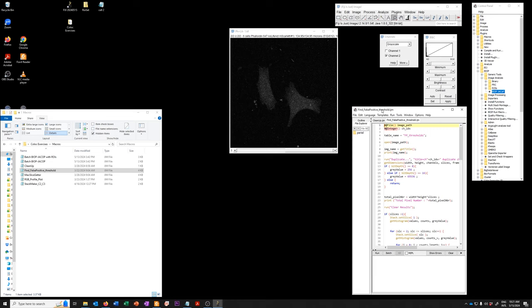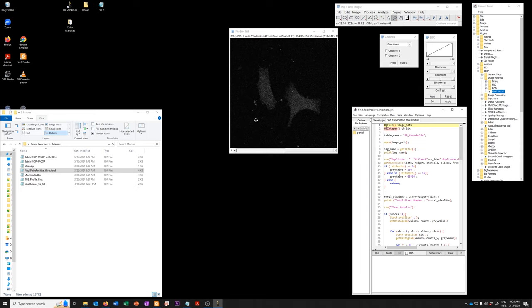So what this macro does is it looks at the histogram of a negative control image and it tells you if you accept a certain fraction of false positives, what is the threshold that you have to use to get that particular fraction of false positives.